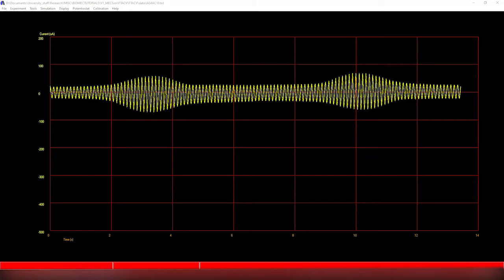So here we have some experimental data used for FTAC-CV. The important thing with these methods is you don't always require triplicate data, but for the more harmonic-based methods, you will need triplicate data for the Bayesian inference to use for harmonics. You can always use the total current methods for Bayesian inference and optimization.